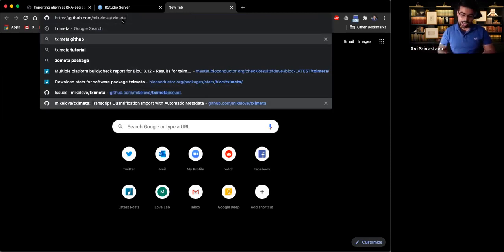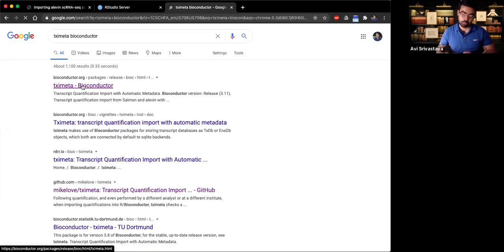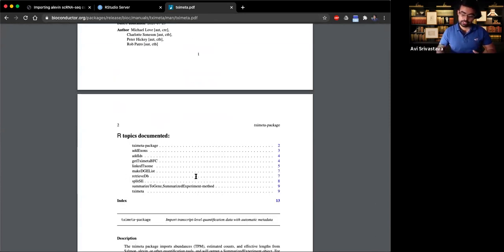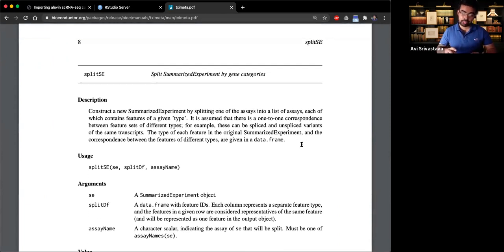For single nuclei, I am still not very convinced what would be the recommended way to go with respect to including the intronic sequences or not. In general, I have found that inclusion and non-inclusion of the pre-mRNA, or immature mRNA, doesn't make lots of difference in Alevin quantification, but the sample of experiments I tested on was relatively very low, and this was on the open 10x dataset.